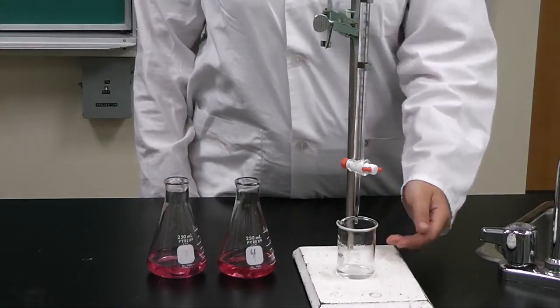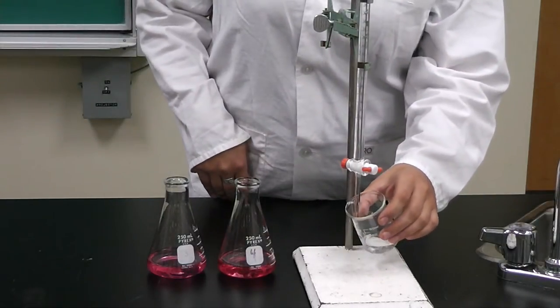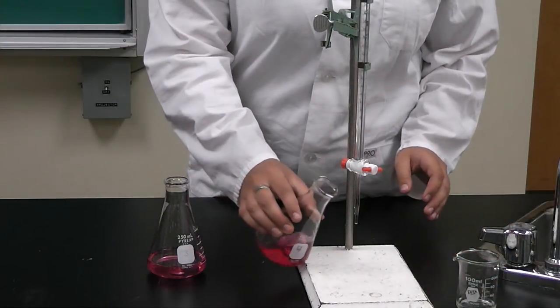When you are ready to begin your titration, simply remove the waste beaker underneath the burette, and place your Erlenmeyer flask with your prepared solution underneath the burette.